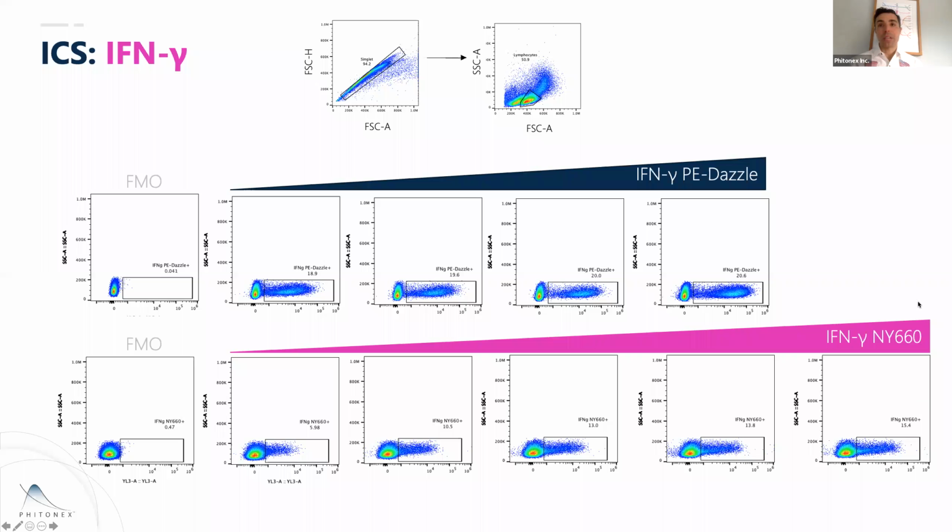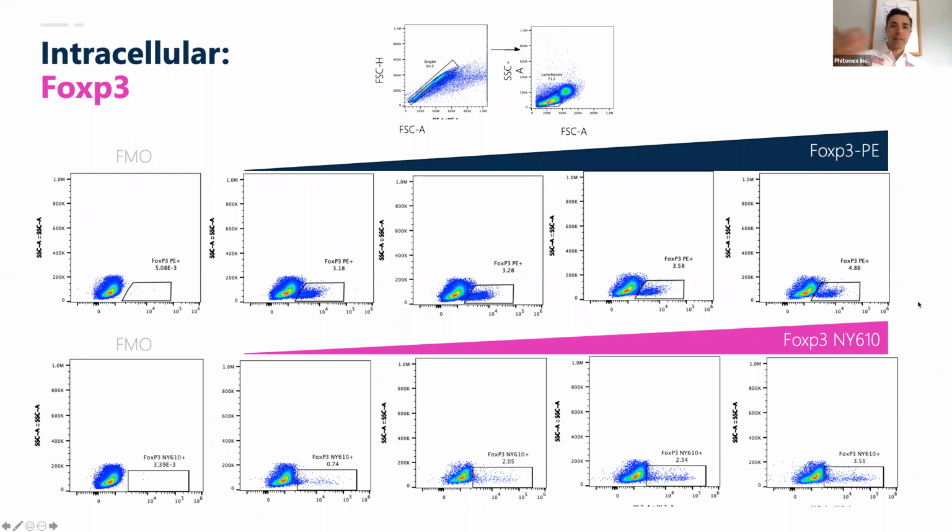And so the second part of this was, okay, net of that, can you also get inside the nucleus with the structure? Again, gating on lymphocytes, looking at FMO, so low background on both of these. And this is where it got really interesting. These are some experiments that we're repeating now and then scaling across other nuclear factors. But FOXP3, this is a titration of that antibody. You can see that the maximum fluorescence we get is about a tick over 10 to the 4.